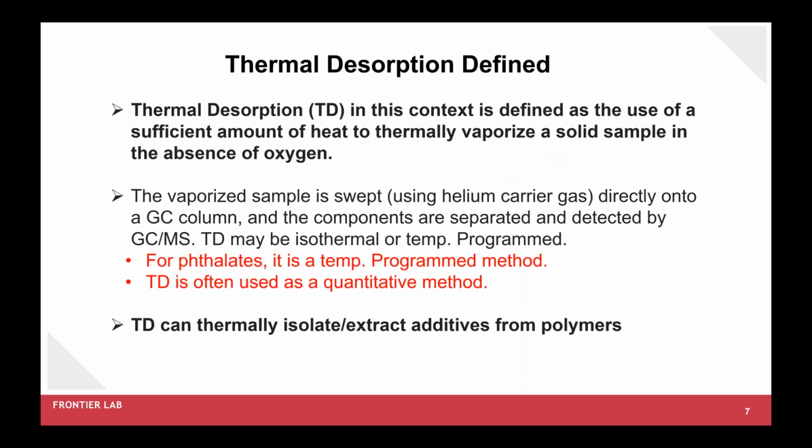One of the traditional techniques for analyzing phthalates is solvent-based techniques to extract the phthalates from the polymeric mixture. The extract is then analyzed using GC or HPLC to separate and quantitate the individual phthalates. These traditional techniques are most of the time time-consuming, costly, and they do not always completely isolate the phthalates from the polymeric mixture.